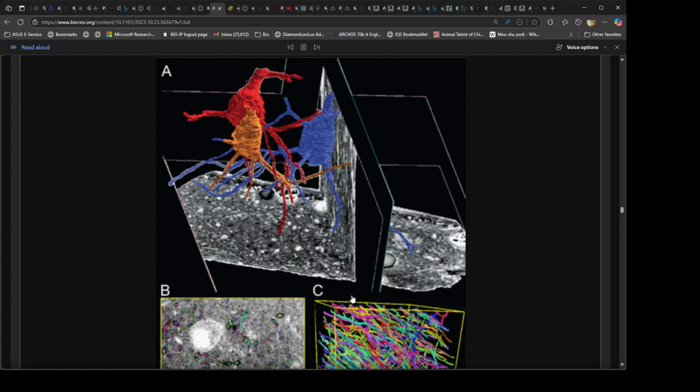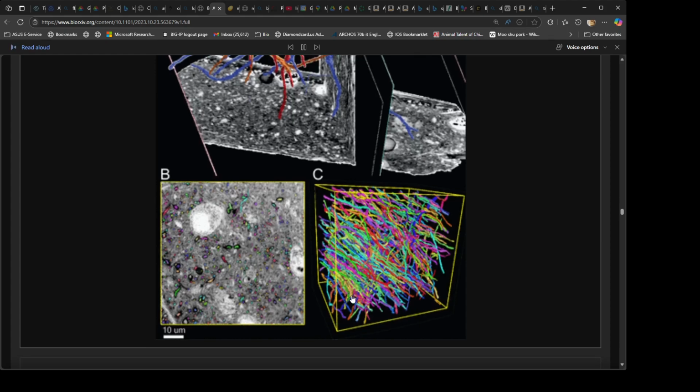Figure 6. 100 nm³ NXCT has sufficient resolution for reconstruction of neuronal morphologies and individual myelinated axons. A. 3D renderings from manual reconstruction of 3 neurons overlaid on a 3D plane view of the raw NXCT data. B. Single 2D image from the NXCT volume overlaid with segmentation of individual MAs. C. 3D rendering of segmented MAs from B. Scale bar equals 10 µm, B.